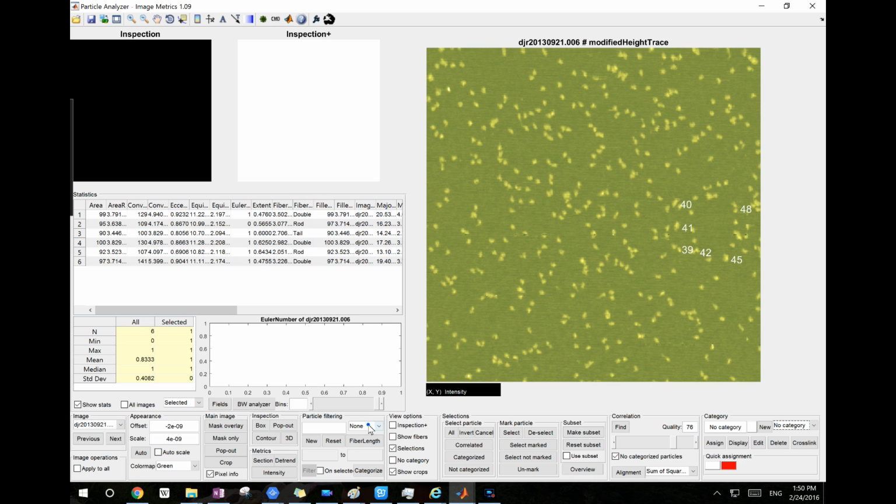Alright, what I would do is make a custom filter for now, because we don't normally use filters for categorization purposes. I use some regions as categories, but I think I will use a mixture of them. So let's make a new filter called custom, a mixture of all kinds of choices. Let's call it mix. So right now I have a selection of these particles, and I can assign them.